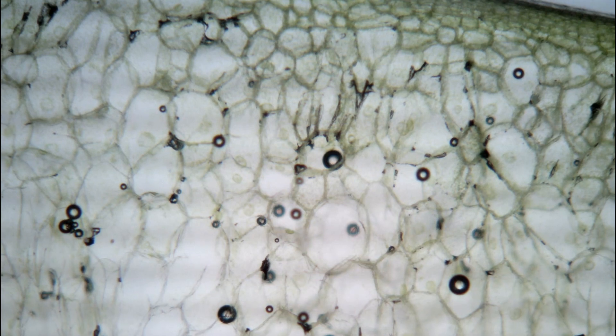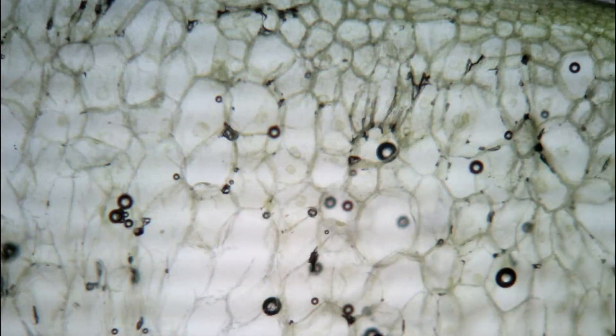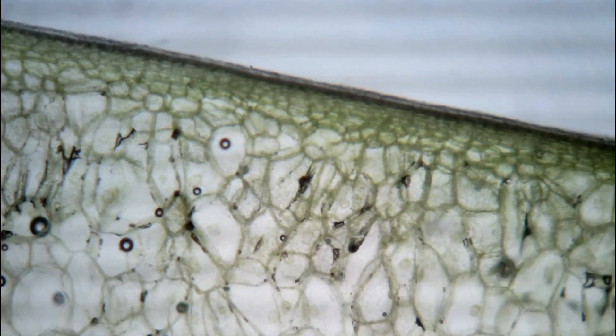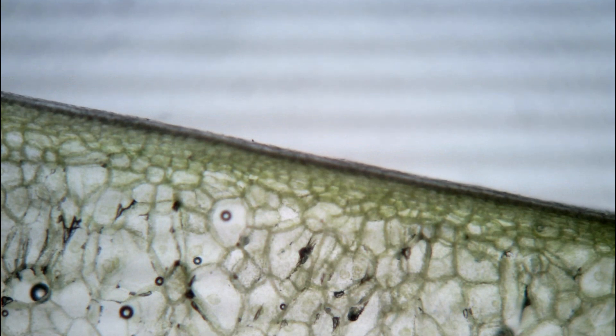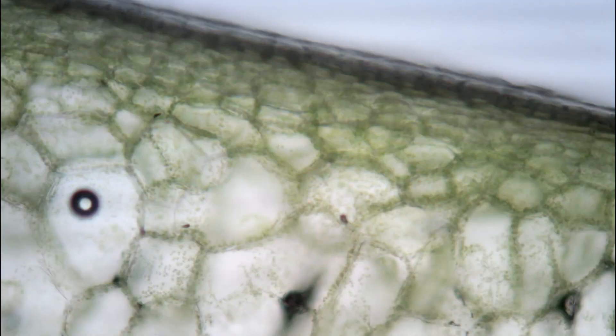Scan your slide under the 4x objective. Focus on the area immediately below the outer darker green skin of the pepper. Scan the tissue in this area and find the thinnest part of your section. A representative green pepper cell will have many small chloroplasts spread throughout the cell and clustered around the spherical nucleus. A nucleolus should be visible.